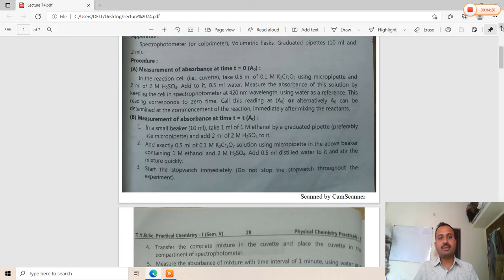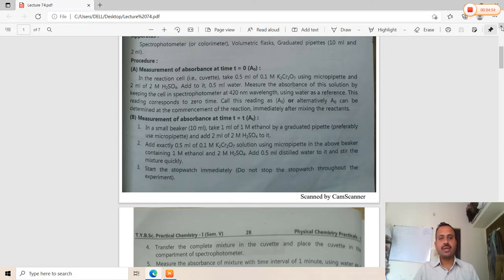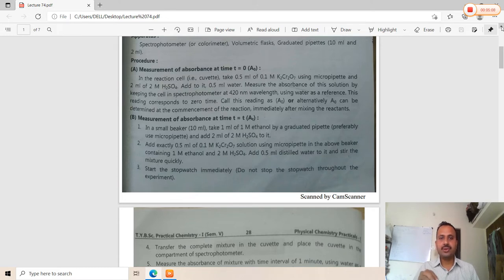The cuvette is a cylindrical or rectangular-shaped glass tube. In it, add 0.5 ml of 0.1 molar potassium dichromate, 2 ml of sulfuric acid, and 0.5 ml of water. This is the reaction mixture. Place the cuvette into the spectrophotometer to get the initial absorbance reading, denoted as A₀.